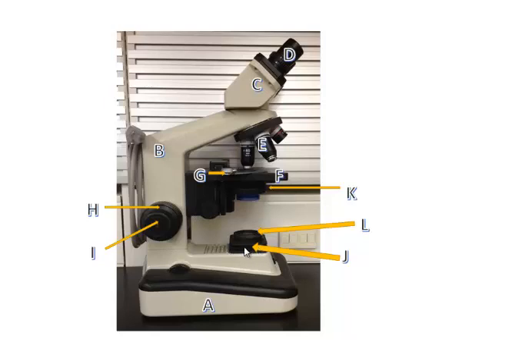Here we have the condenser. The condenser is going to focus the light, and here we have the substage light, which obviously is the light source that's going to travel through here so you can see what's on the slide. The last structure on here is the iris diaphragm, and that controls how much of this light gets through so you can see the slide. What you'll find as you go up higher and higher objectives is that less and less light gets through, and so you're going to have to modify the amount of light that comes through to be able to see the slide, and you do that with the iris diaphragm.